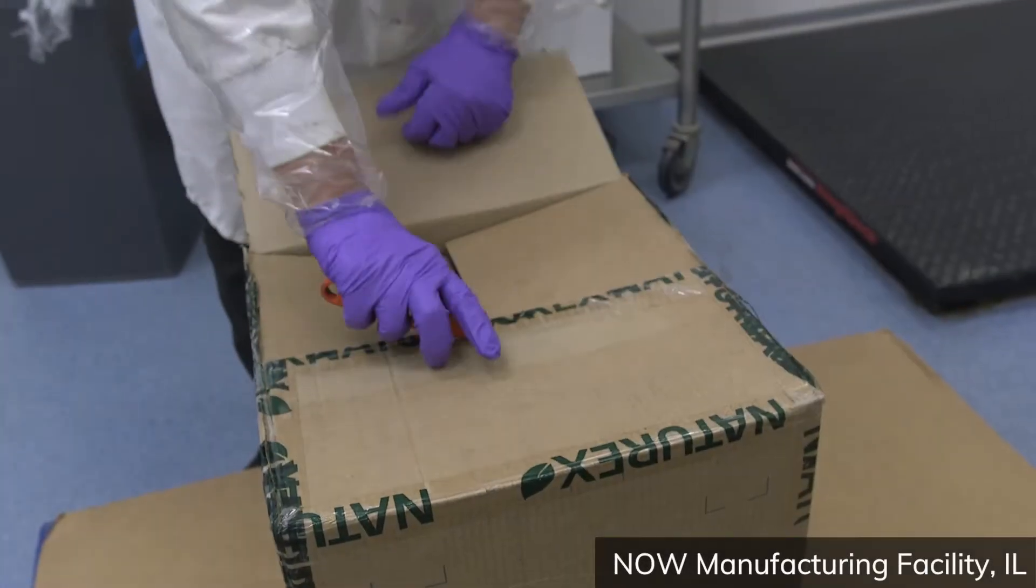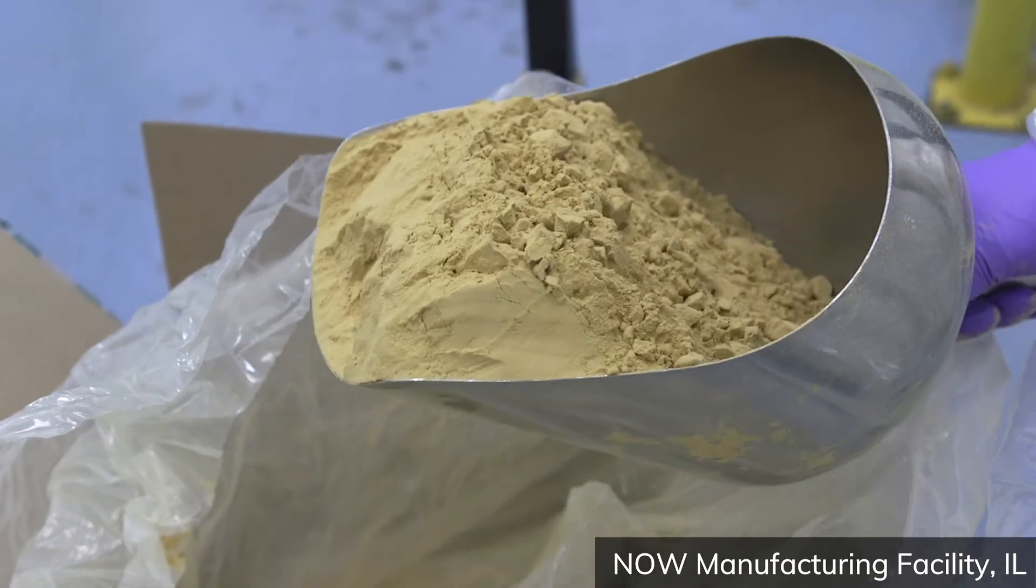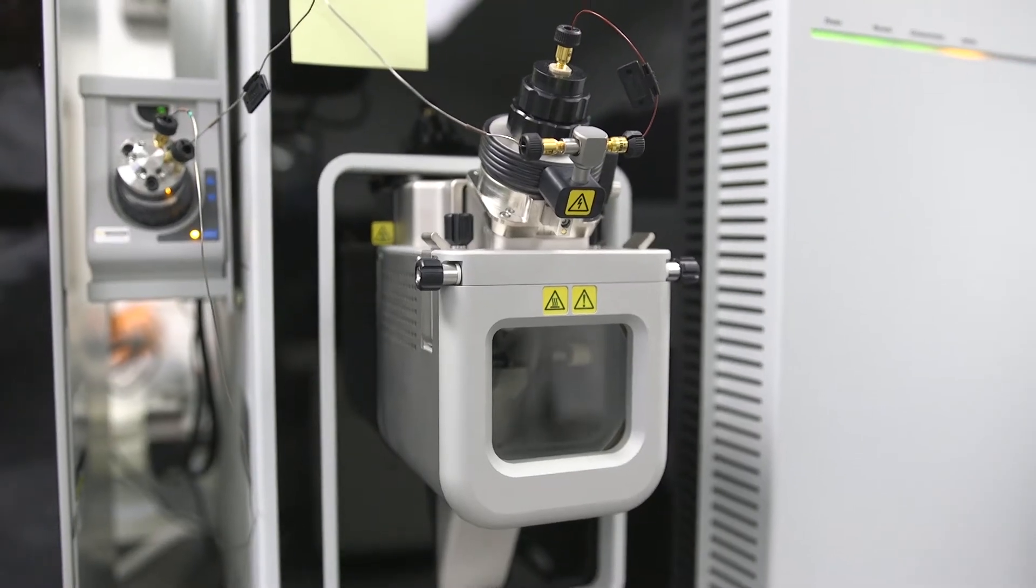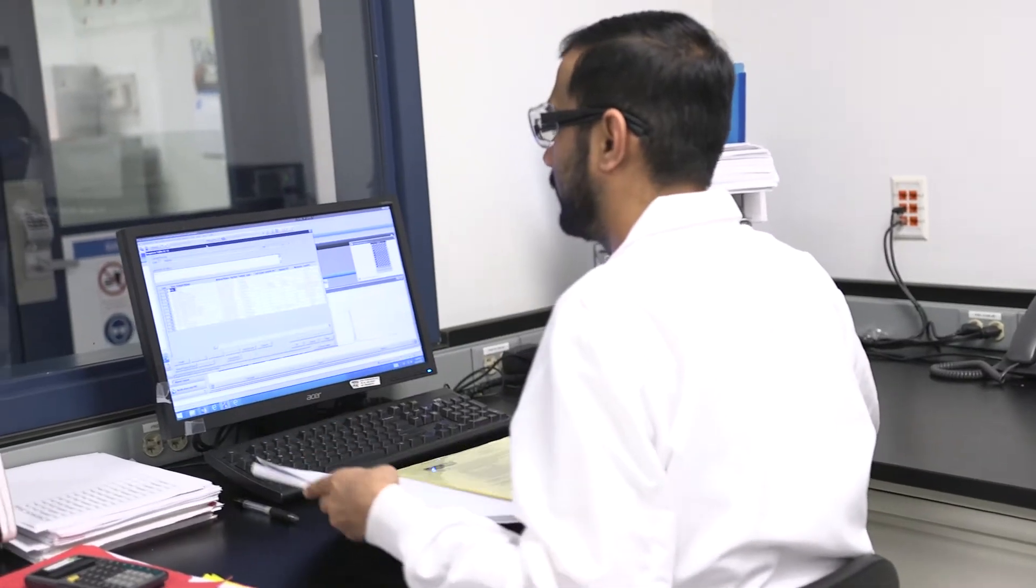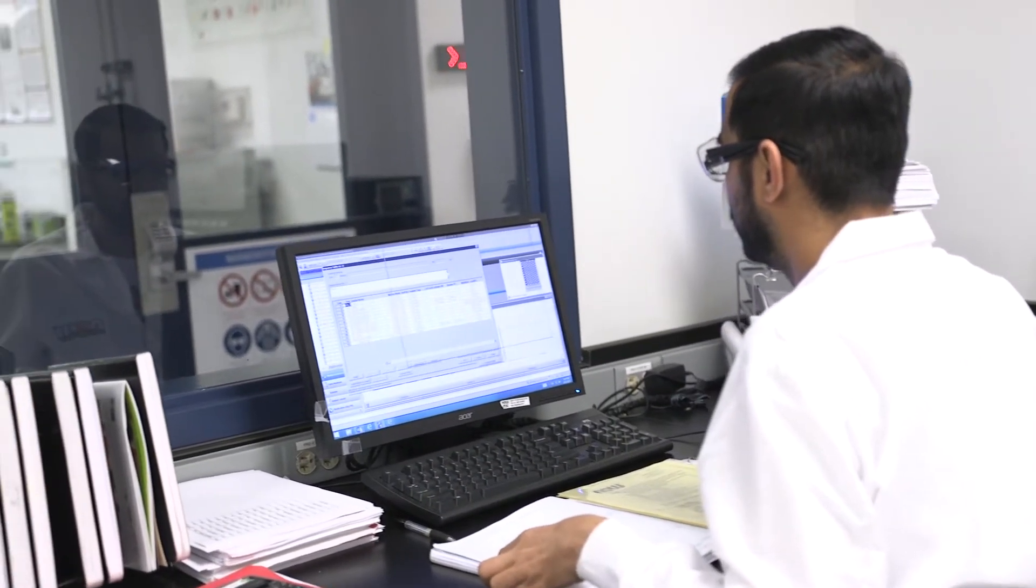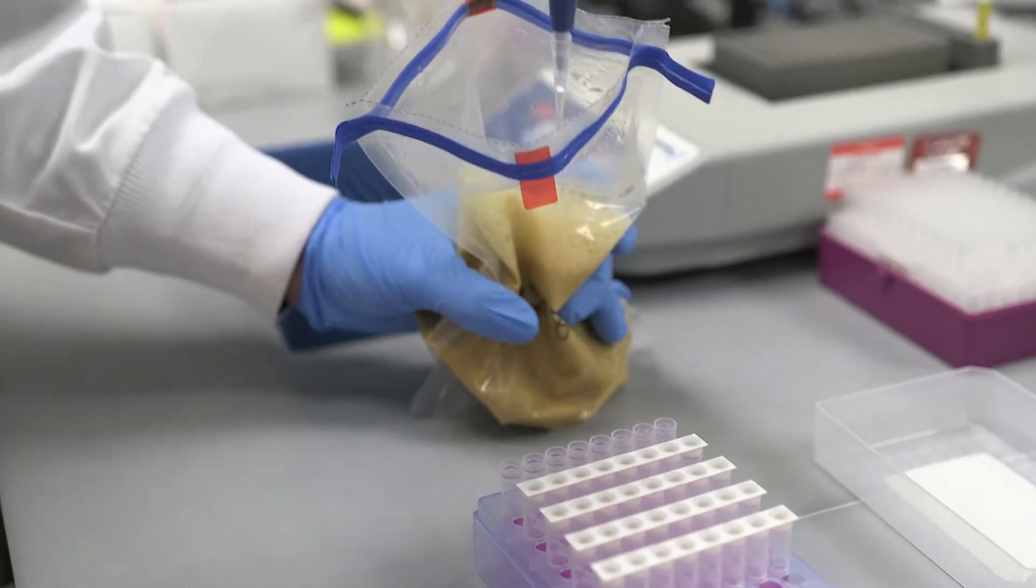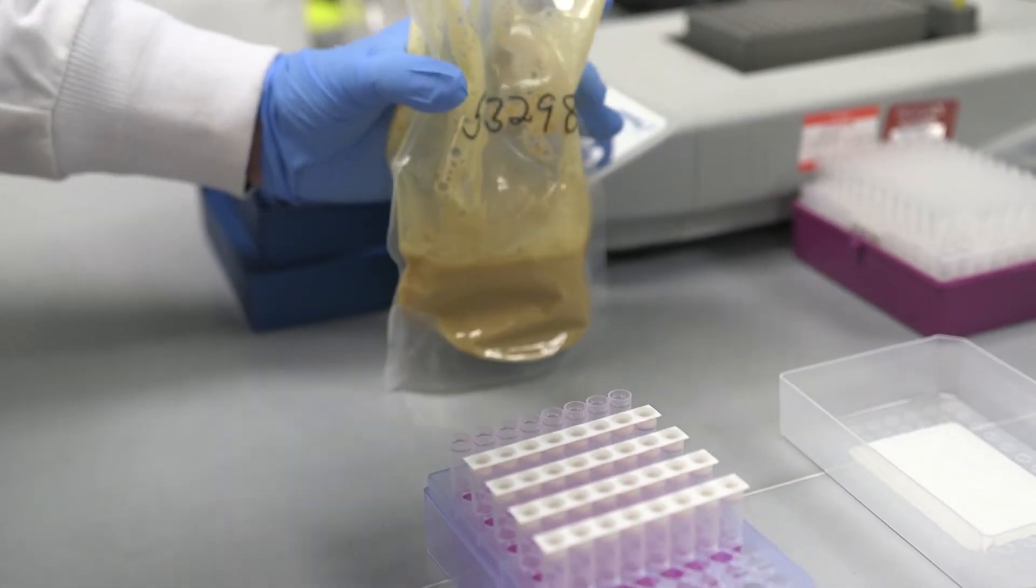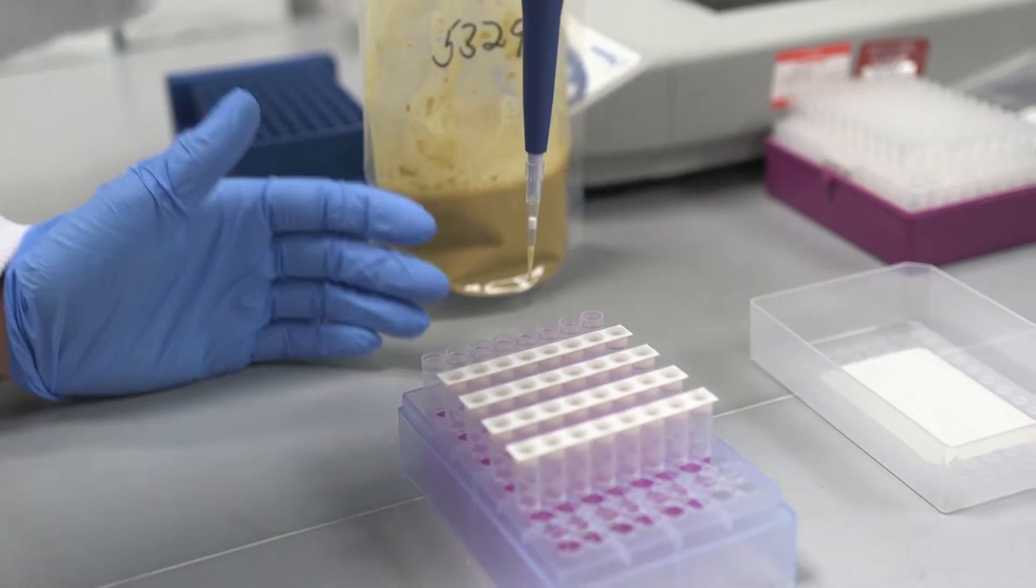Once the material is received here at our facility, we will take a sample of the material and it will be tested in each of our laboratories. It'll be tested for the toxic heavy metals like lead, cadmium, arsenic, and mercury. We'll also test it in the micro lab to make sure that there are no harmful pathogens like Salmonella, E. coli, or Listeria.